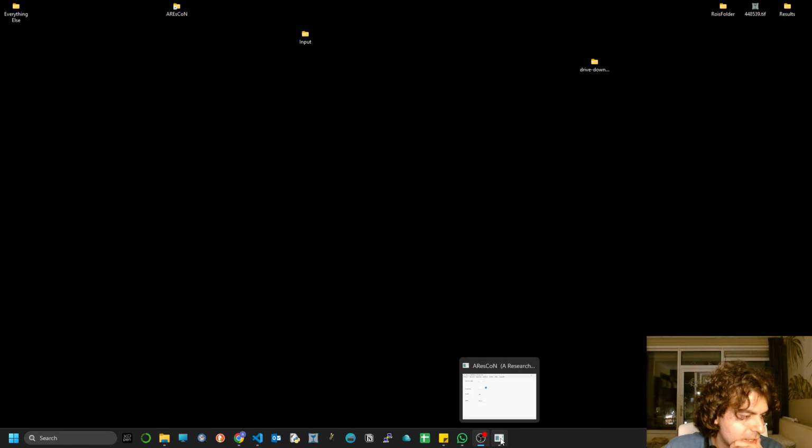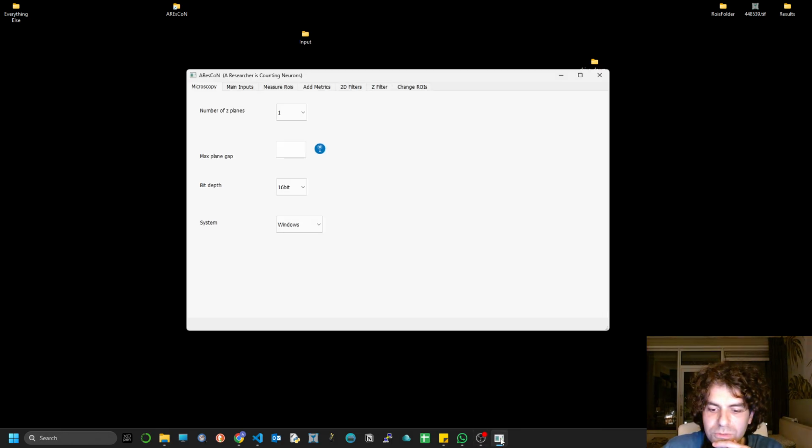Hope you see that bar. Yes, you can see. So just click on that and it should be fine.